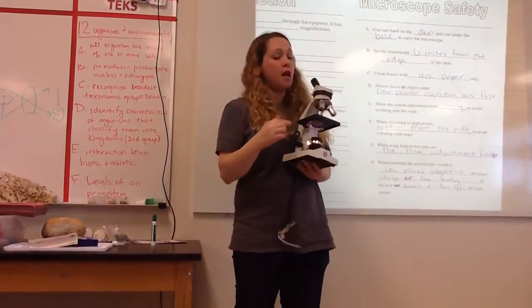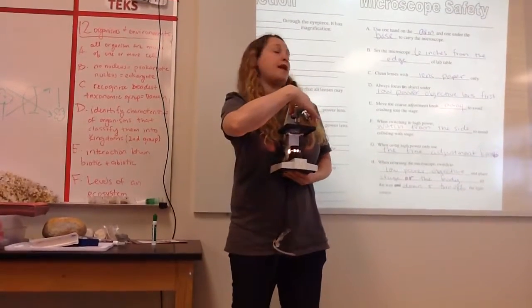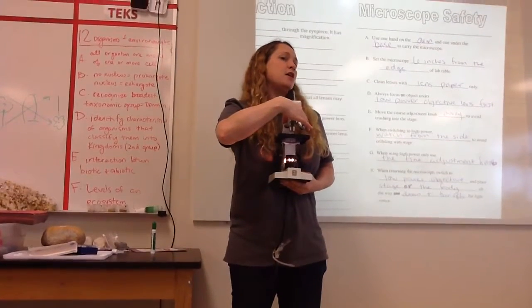We have three choices here. I'm going to the 10 times power. I'm not going all the way to 40 yet, okay? So again, I'm gonna listen really close, make sure it clicks into place.